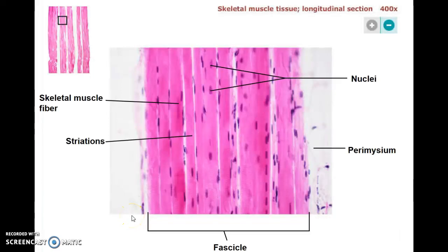All right, anatomy and physiology students, this is a review of the skeletal muscle tissues from the lab. As always, I'd like to remind you that you should use your wish list as you look through this to be sure you are just identifying the things that I ask you to know, because there may be other things labeled on the slides.